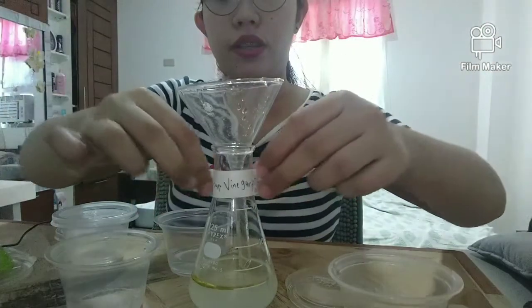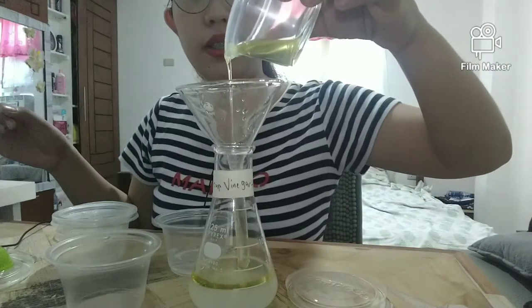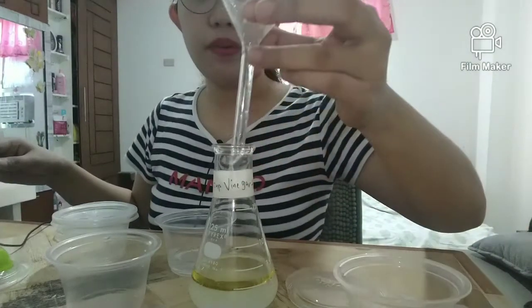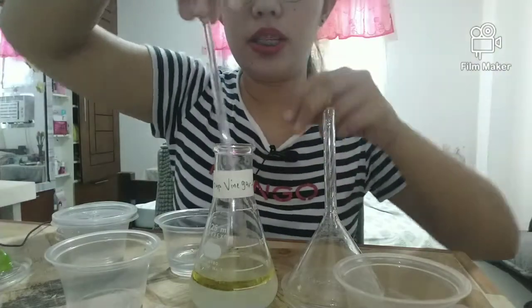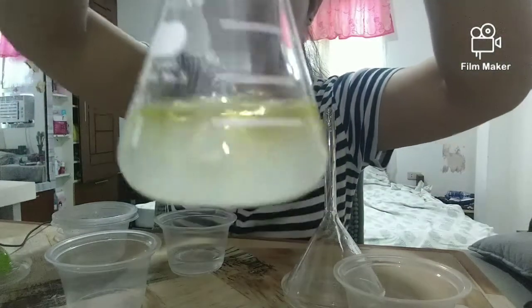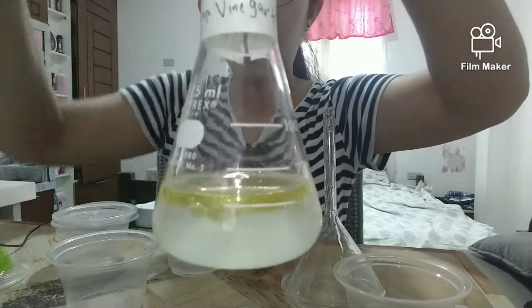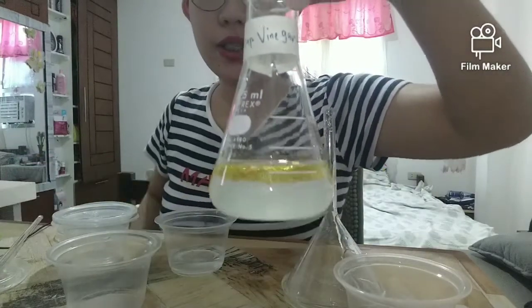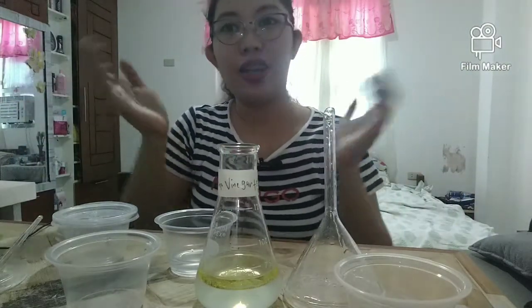What do you observe on setup number 4? Did it mix well or not? Let's try to stir it. Even when stirred, the compounds did not mix together. Write it on your answer sheets and pass it on the expected date.